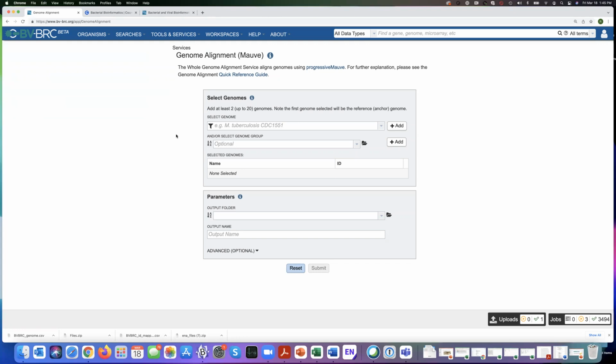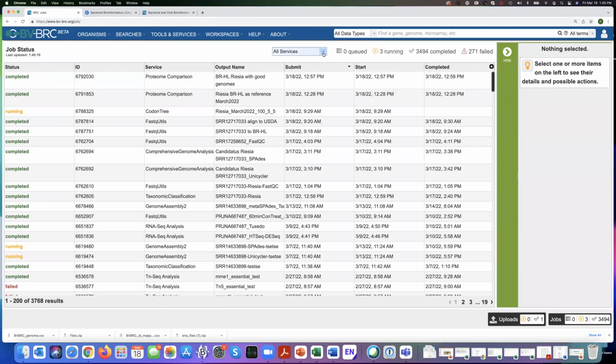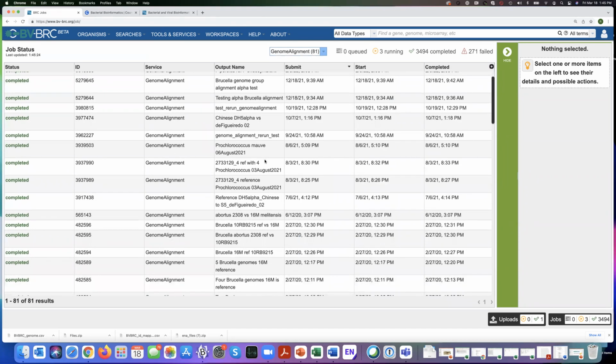Now, if your genome is just in a few contigs and they're pretty clean, I have done it by using Mauve. And let me show you an example of how easy it would be, at least in this one with the genome alignment. It was one of my Brucella ones. Is this it? Let's see.